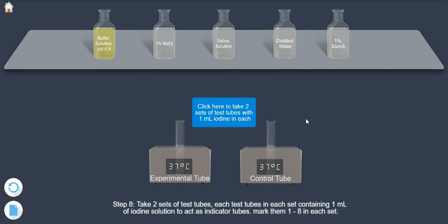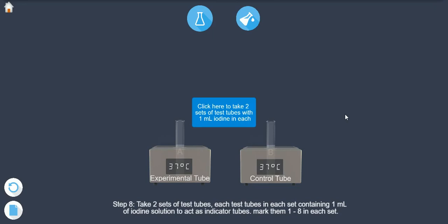Step 8: Take 2 sets of test tubes, 8 test tubes in each set, containing 1 ml of iodine solution to act as indicator tubes. Mark them 1 to 8 in each set.